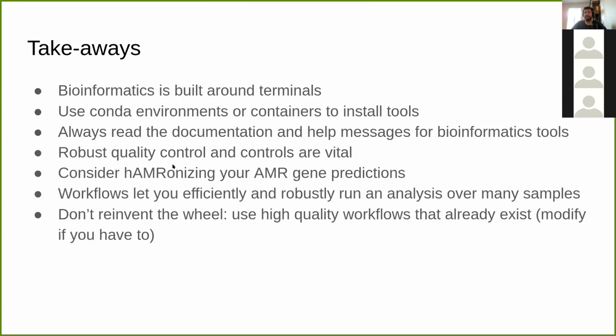So, key takeaways. I know this is a bit of a whirlwind. Bioinformatics, unfortunately, is generally built around terminals. Things like Galaxy can help, but there are a lot of tools you won't be able to access via Galaxy. I highly recommend using Conda environments and containers to install tools. Always try to read the documentation and help messages for bioinformatic tools. Most tools actually do have some decent documentation that explains a lot of the issues and use cases. Robust quality control and experimental controls are vital, as they are in any bit of research.